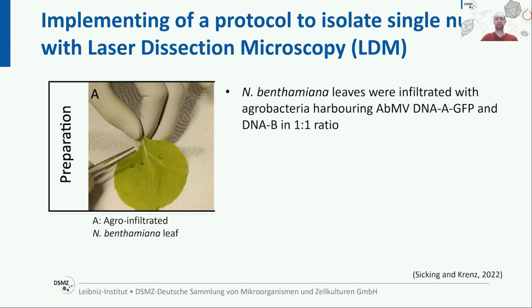Hello, everyone. Also from my side, I'm happy to present you some of the results I've produced with the MMI CellCut system. So here our lab has developed a method to work with actually living cells. This approach therefore avoids the issues associated with fixation and allows us to study cellular processes as they occur.